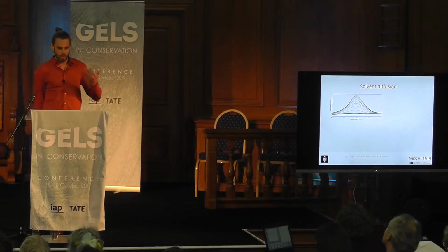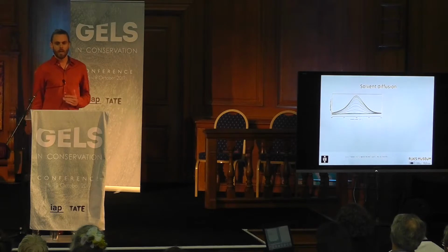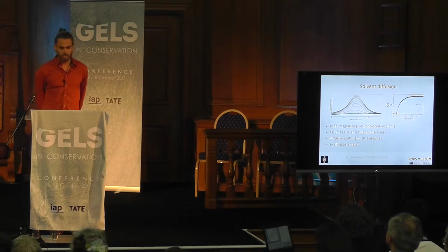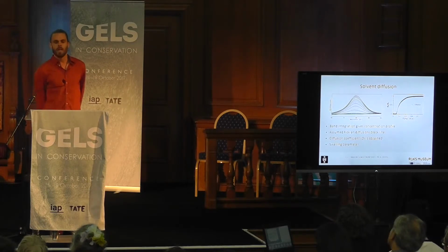However, when the solvent starts diffusing into the system, you see that these characteristic bands are growing, as exposed here. And by doing an integration of this band, one can obtain a concentration profile for the solvent in the polymer. I call it polymer. We can call it paint as well, but it's in this case no pigment.